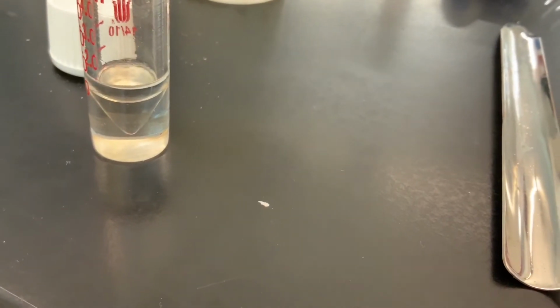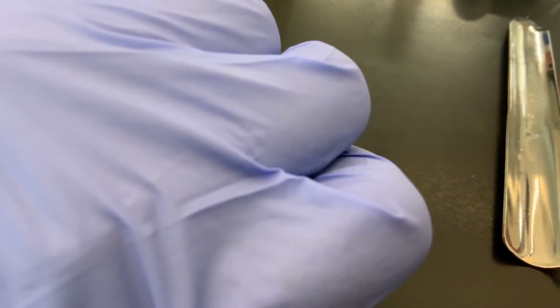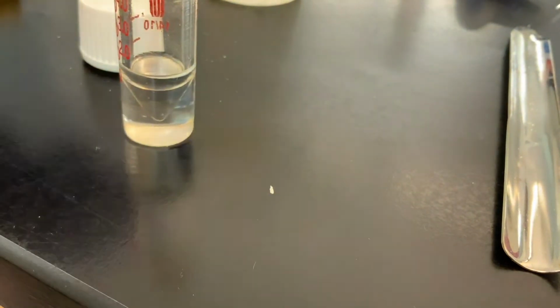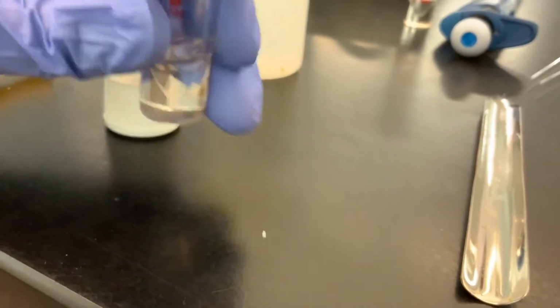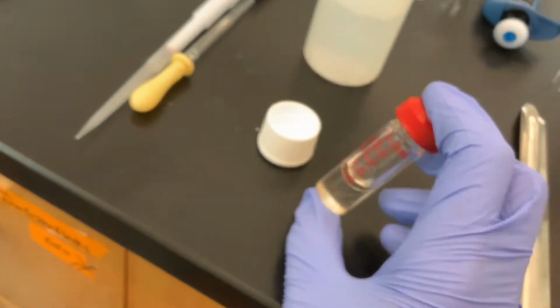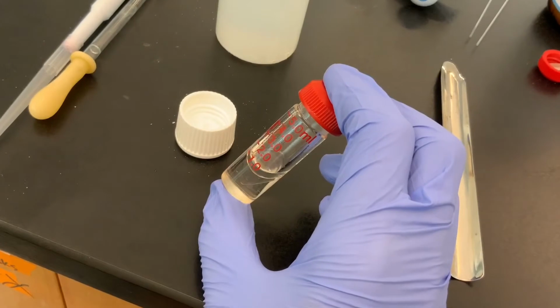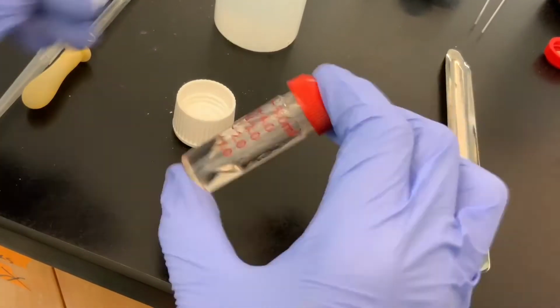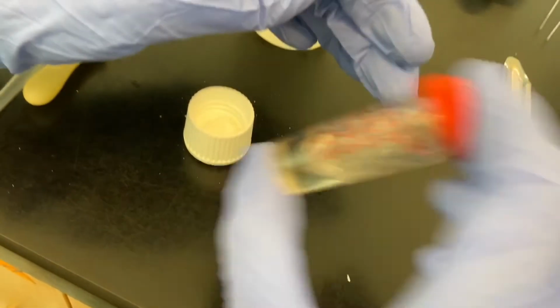So now we're going to shake it. The proton transfer is very fast. It's one of the fastest reactions, and essentially immediate. So watch as I shake it, and you can hear it, maybe, but I'm venting it, and CO2 is coming out.